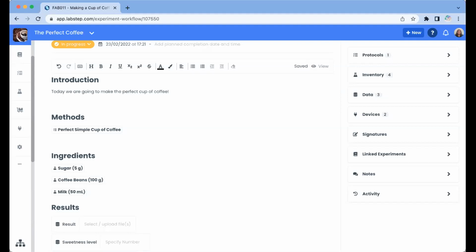So there we go. So now let's just go over all of the things we've seen today, have a little webinar recap, summarize the topics that we've seen, and then we'll go into our Q&A.